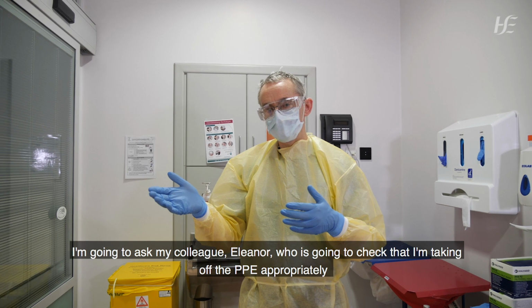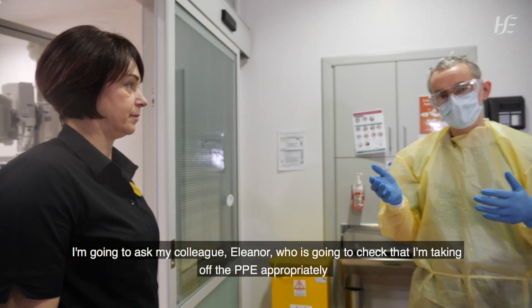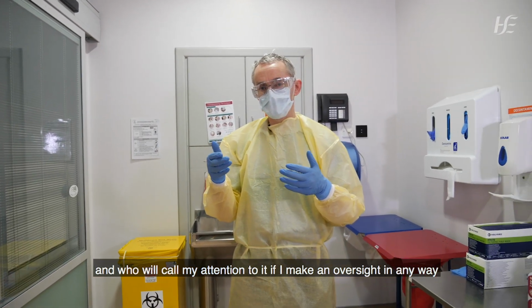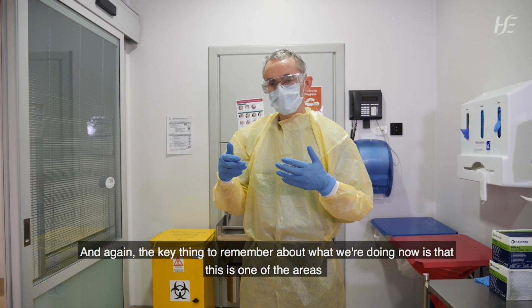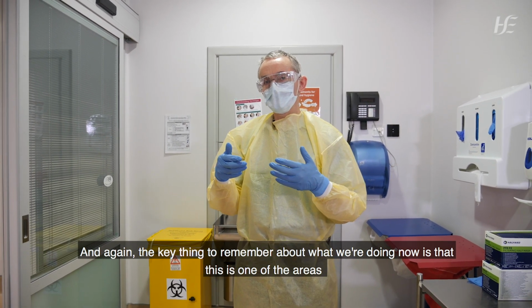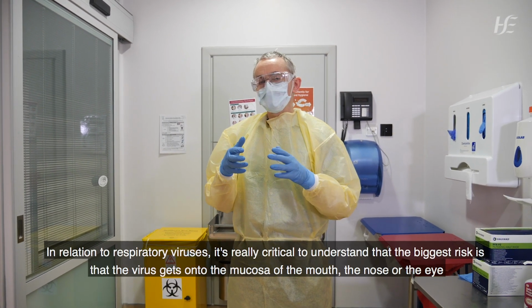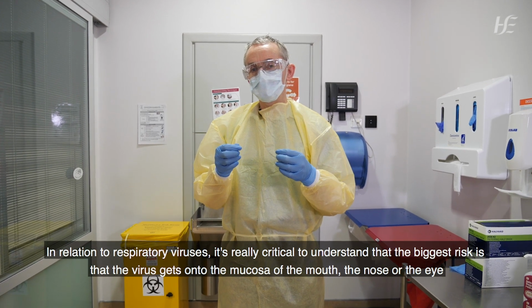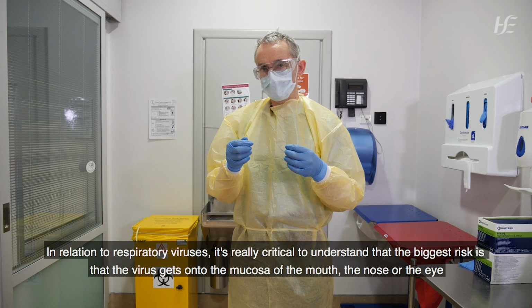So I'm going to ask my colleague Eleanor, who is going to check that I'm taking off the PPE appropriately, and who will call my attention to it if I make an oversight in any way. And again, the key thing to remember about what we're doing now is that this is one of the areas where there is a risk of contamination of the hand. In relation to respiratory viruses, it's really critical to understand that the biggest risk is that the virus gets onto the mucosa of the mouth, the nose, or the eye.